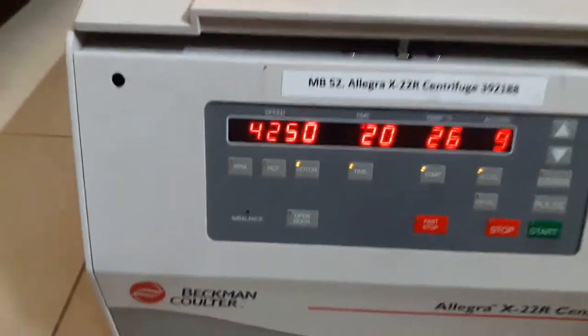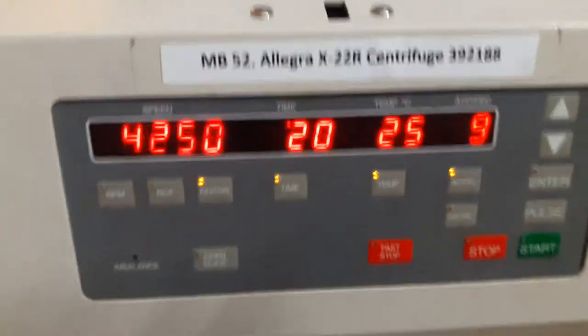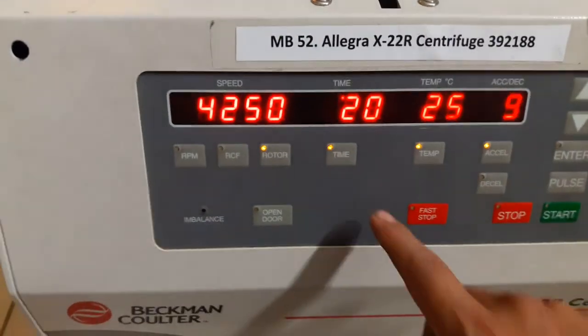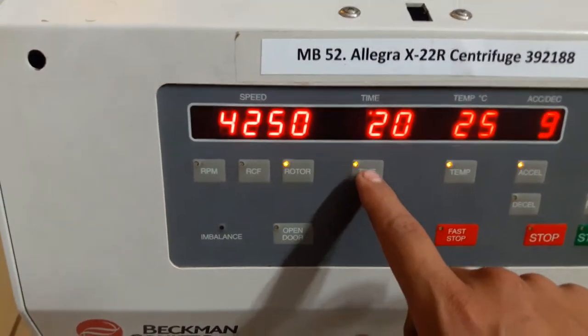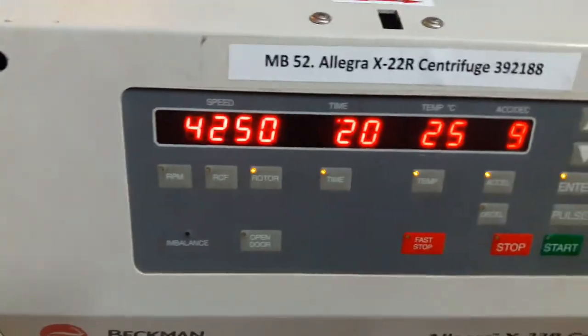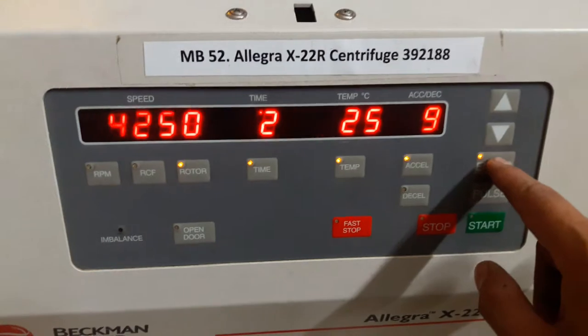Let me open the bucket and show you the type of rotor. My rotor is the SX4250, so I just selected 4250 and pressed enter. This button is for the time — I have selected 20 minutes here and now I'm pressing enter.